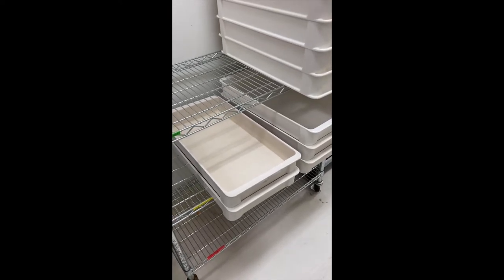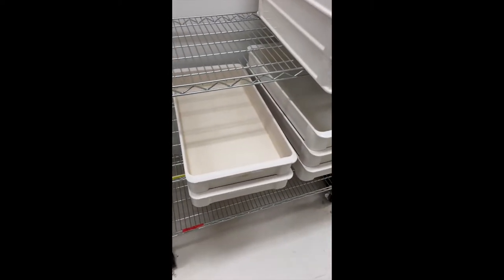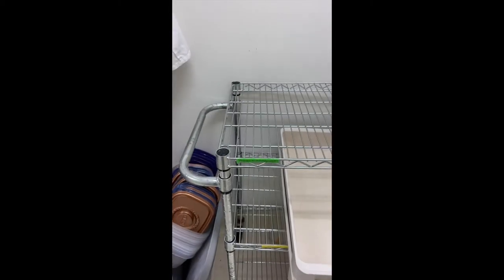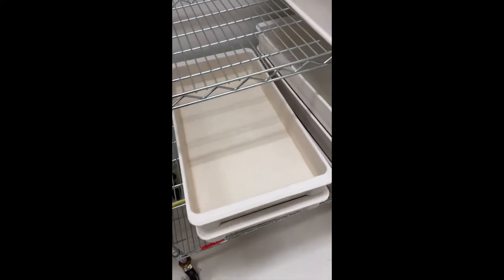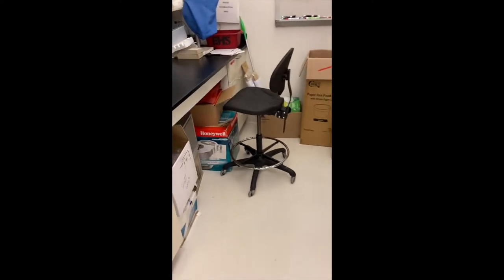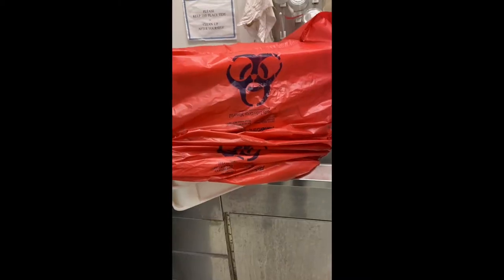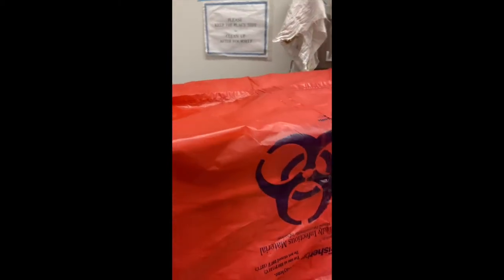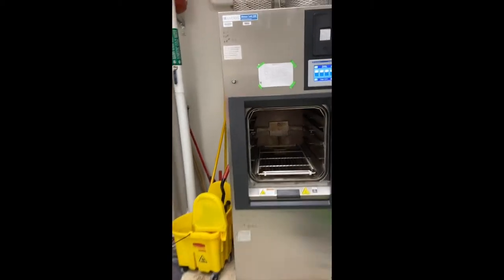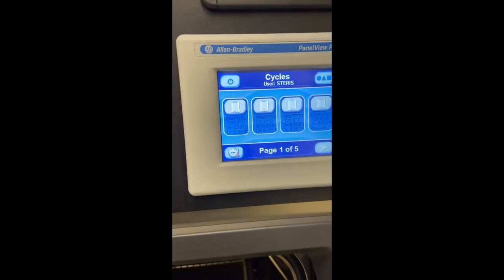When the trays are washed but not yet autoclaved, they go on this middle shelf. Washed and autoclaved trays go up on the top shelf or in the confiron. To autoclave them, we need a very large biohazard bag — person height — from under the bench. Put the trays upside down on the counter, flip the bag on top of them, loop the bag closed, and stick it in the autoclave. It goes on gravity one, 45-minute cycle, and then they're all set.